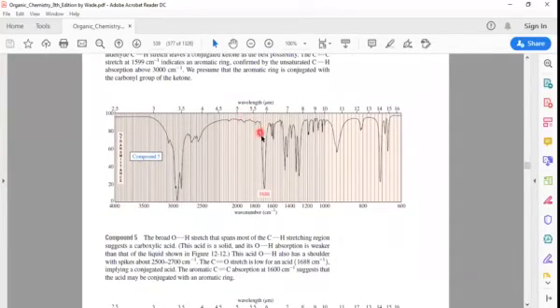This peak at 1688, and then this is your 3000. Most peaks are on this side. The broad OH stretch spans most of the CH region, which means it is the broad region of a carboxylic acid. This acid is a solid, and its OH absorption is weaker than that of the liquid.